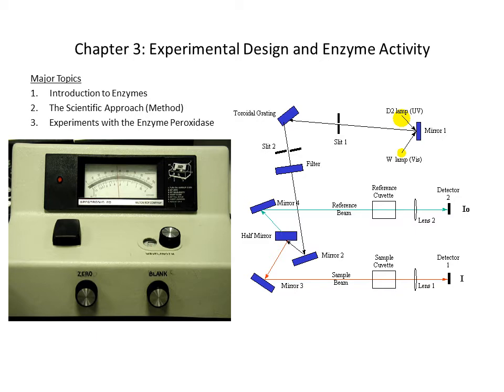That's spectrophotometry. We'll have to make a baseline measurement, which means we're going to put everything that's the same except the actual reaction materials to see what type of light it normally absorbs, and then when that reaction is actually going, we'll see the real difference by being able to subtract the baseline.